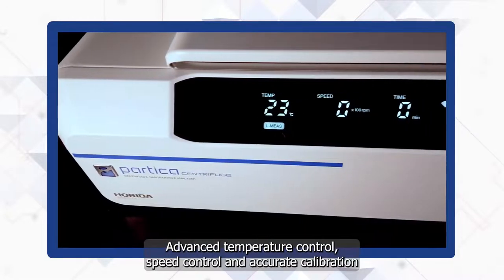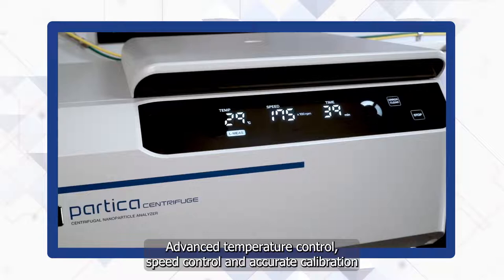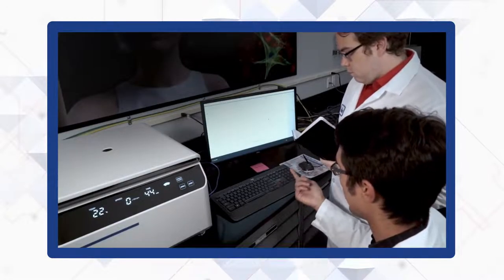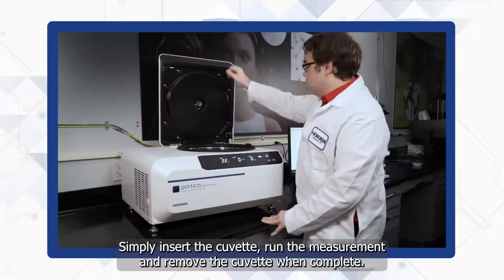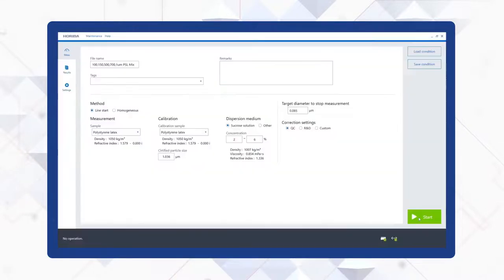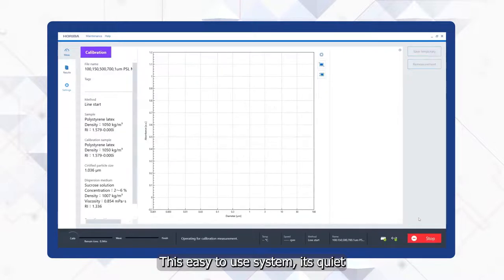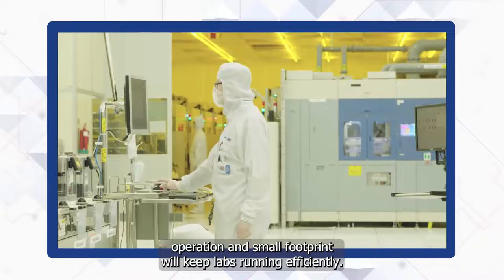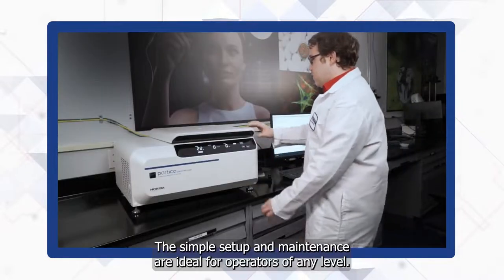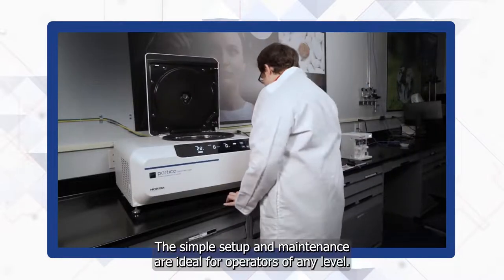Advanced temperature control, speed control, and accurate calibration create optimum conditions for precise measurements. Simply insert the cuvette, run the measurement, and remove the cuvette when complete. This easy-to-use system, its quiet operation, and small footprint will keep labs running efficiently. The simple setup and maintenance are ideal for operators of any level.